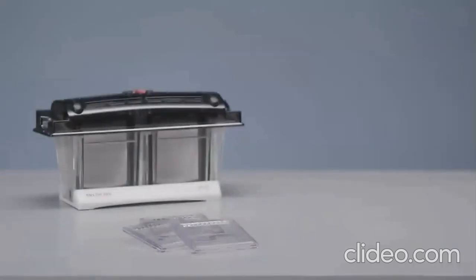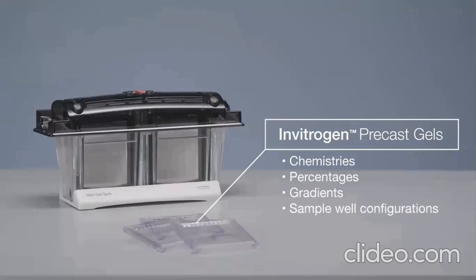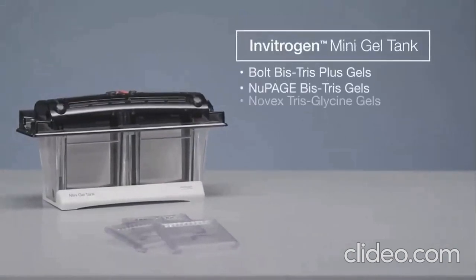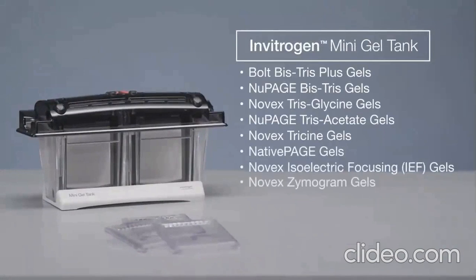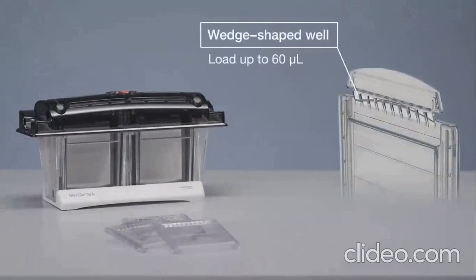Thermo Fisher Scientific offers a wide variety of Invitrogen precast gels in different chemistries, percentages, gradients, and sample well configurations. Make sure you choose the right protein gel based on the size of your protein and your downstream applications. This video will show you how to separate proteins by using the Invitrogen Mini Gel Tank, which is compatible with a wide range of precast and pour your own gels, and the Invitrogen Bolt Bis-Tris Plus Precast Gel, with a wedge-shaped well designed to enable the loading of sample volumes up to 60 microliters per well.